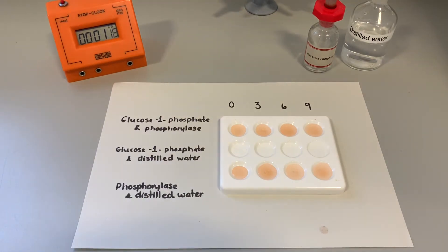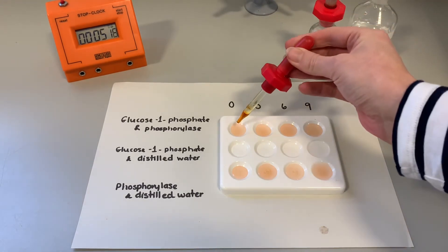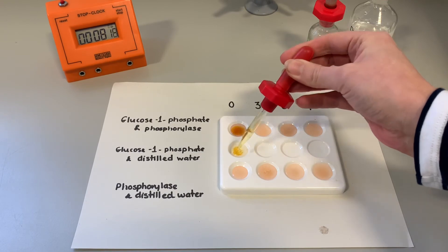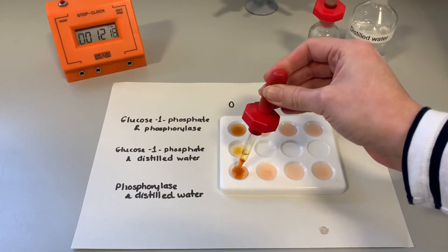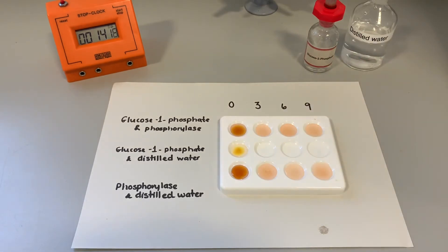So we'll start our stop clock now and what we'll do is add iodine to the first row and see if any starch is currently present. So as we can see, no color change, therefore no starch is currently present.